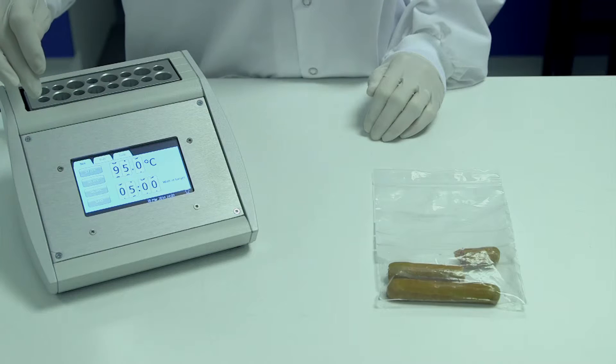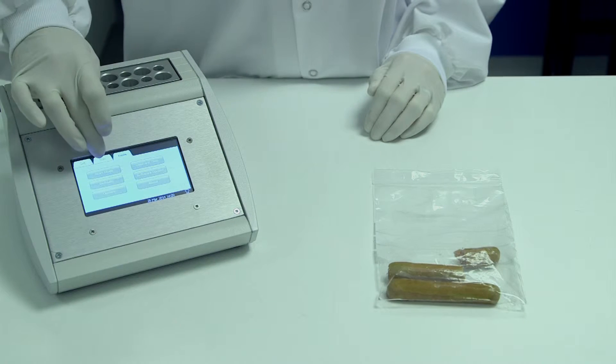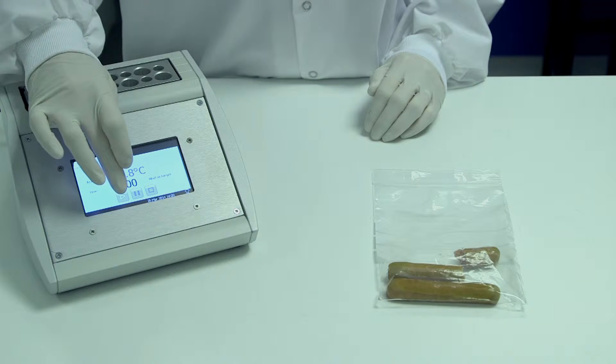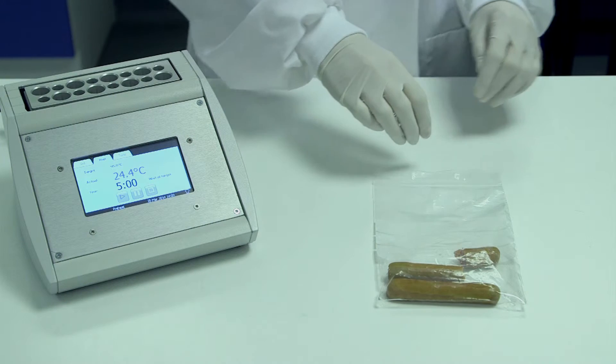To begin, set the Genie heat block to 95 degrees Celsius. Whilst the instrument is heating, the sample of meat can be prepared.